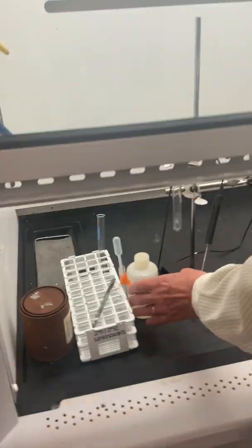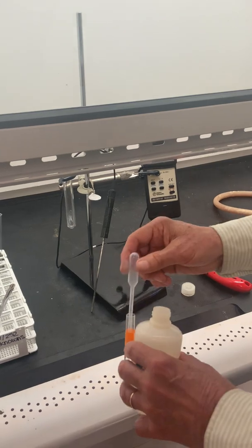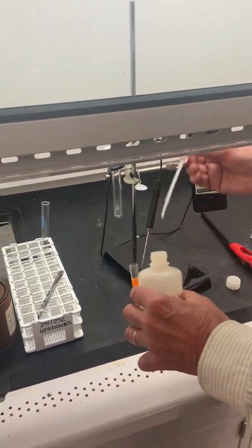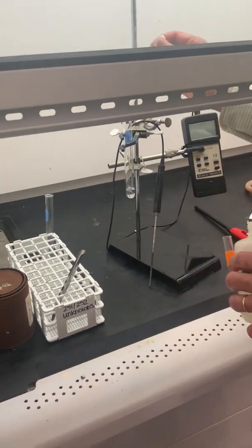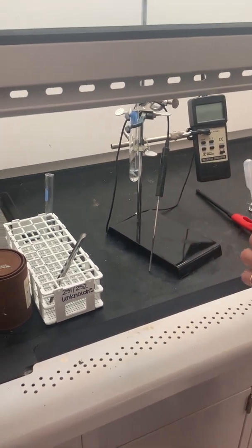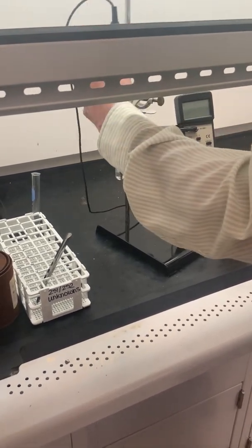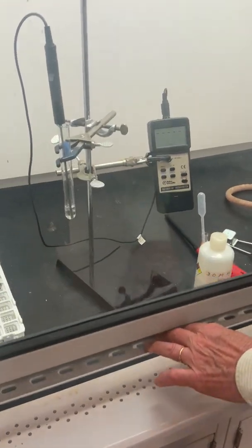Reaction number 6, a single replacement reaction between a metal, again magnesium, one of our go-to metals for relatively quick chemical reactions, and an acid, in this case hydrochloric acid, again one of our dependable reagents in inorganic chemistry lab. Here the hydrochloric acid is going into the test tube, and I'll do this reaction twice to demonstrate what's going on.